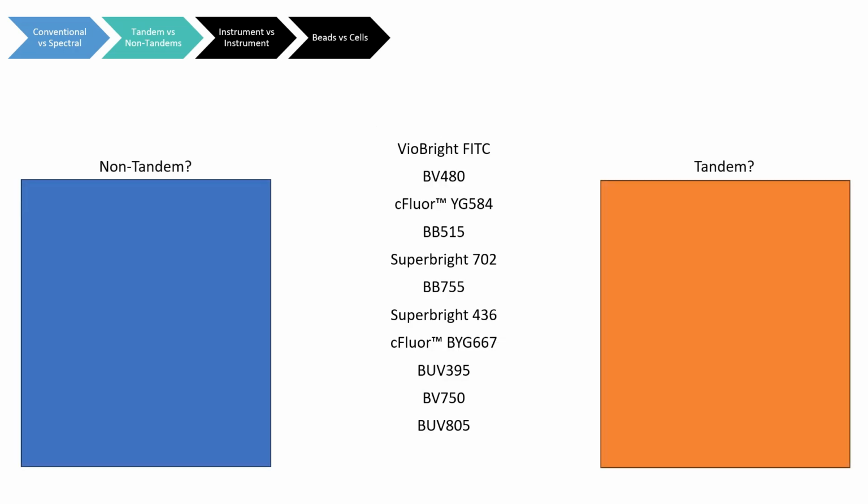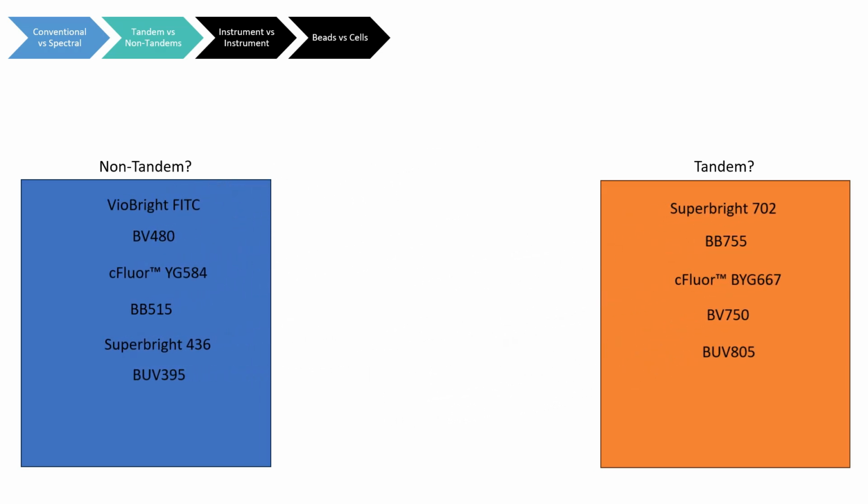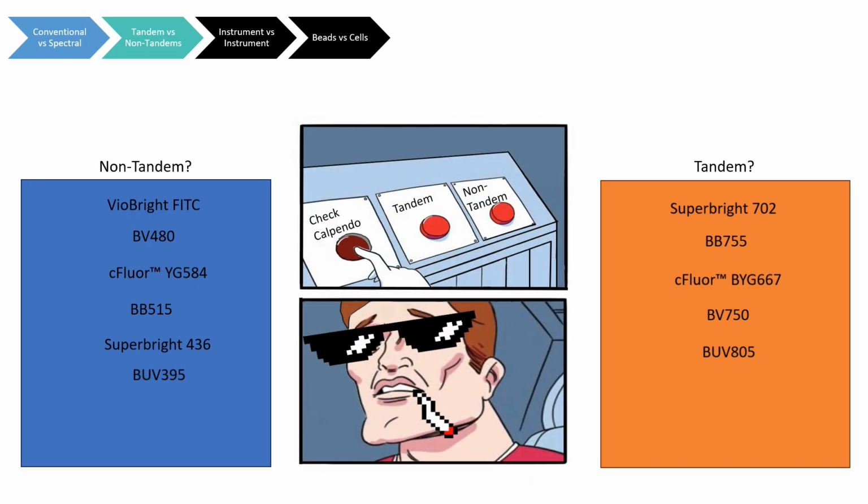It is not always obvious what is or is not a tandem. If you are unsure, check the website of the manufacturer, or we have a not exhaustive list of tandems and non-tandems in the lab and on the Calpendo booking page. The cool kids always use Calpendo.